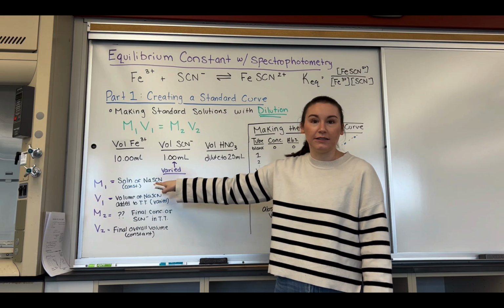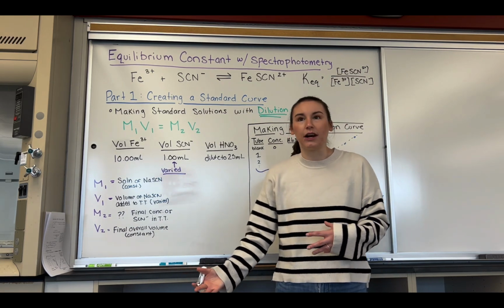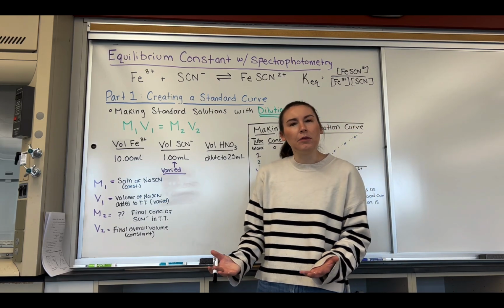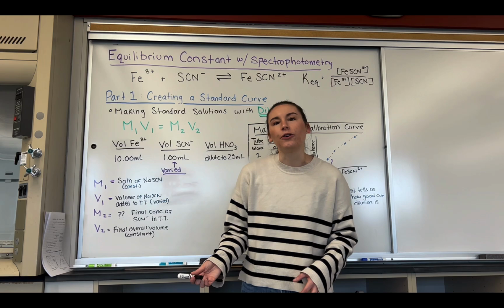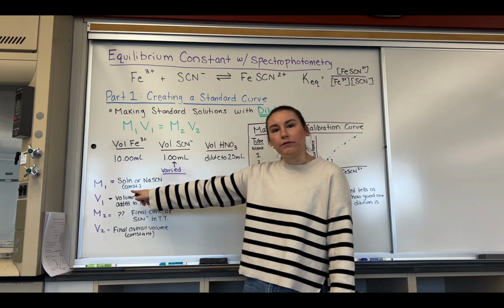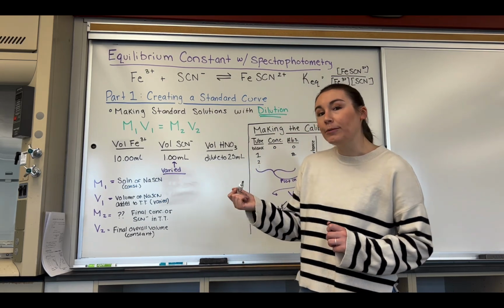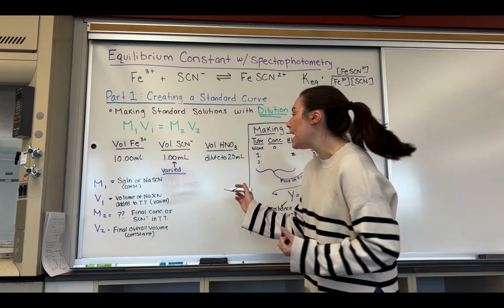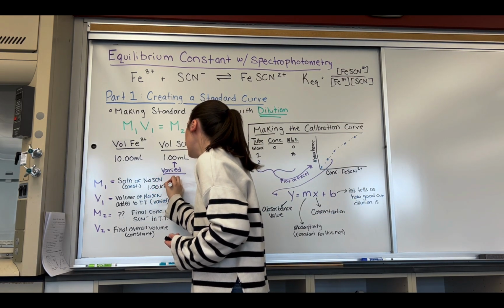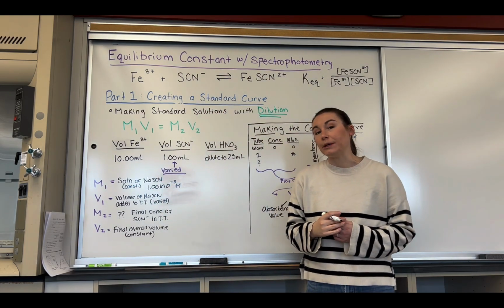That's what the thiocyanate ion is dissolved with, is potassium, or sodium, sorry. I believe on LabFlow it may also say potassium, it just kind of depends. They're the same thing, they're in the same group, they're just there as a counter ion, so don't worry if it's different, okay? All we care about from that information is the concentration that we get. So in my concentration that I'm going to be using in our lab today, that concentration is 1.00 times 10 to the minus 3 molar.